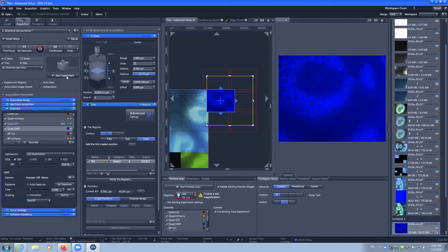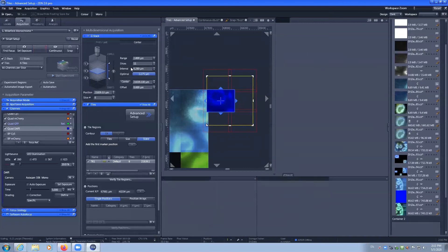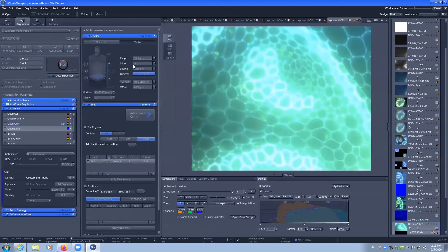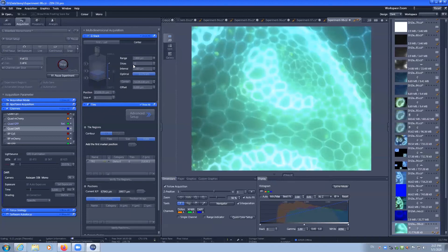So in this capture, we'll have 11 Z positions, three channels, and six positions to build up our tile. And that's going to take a minute to capture.